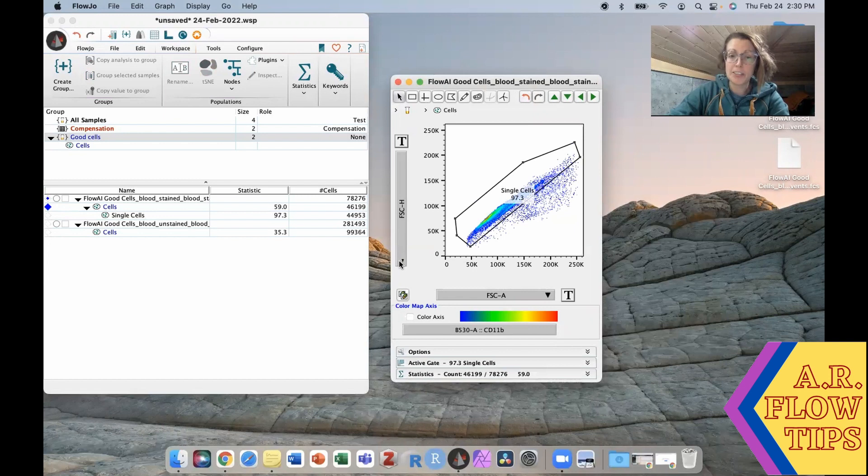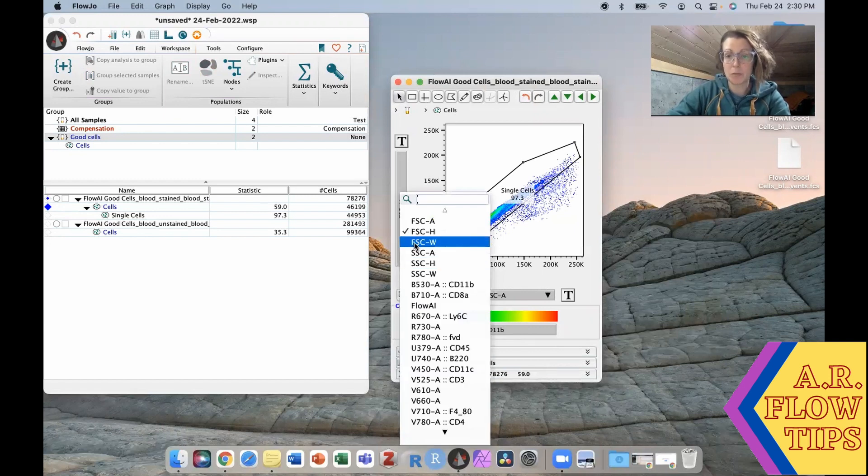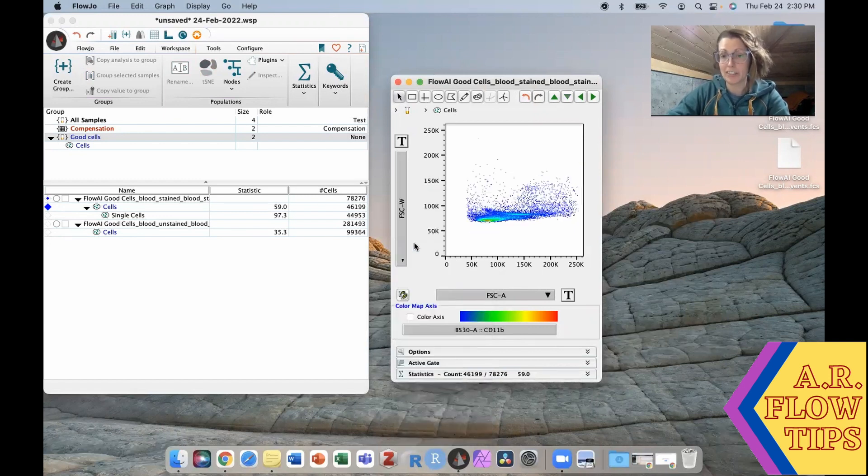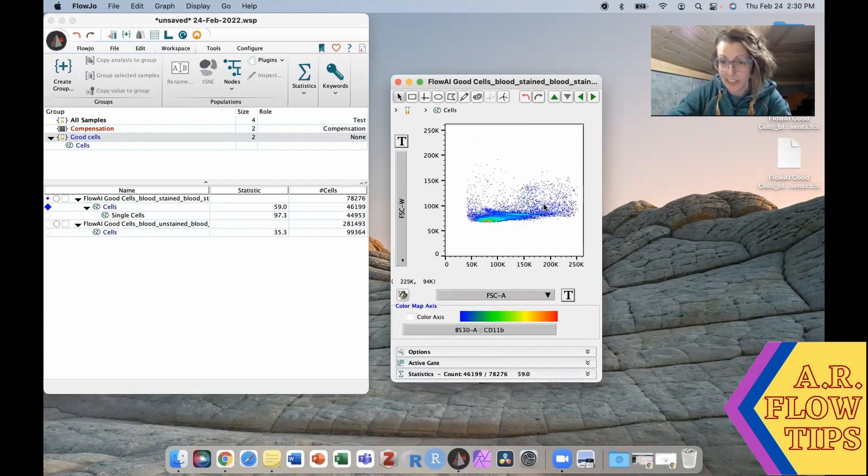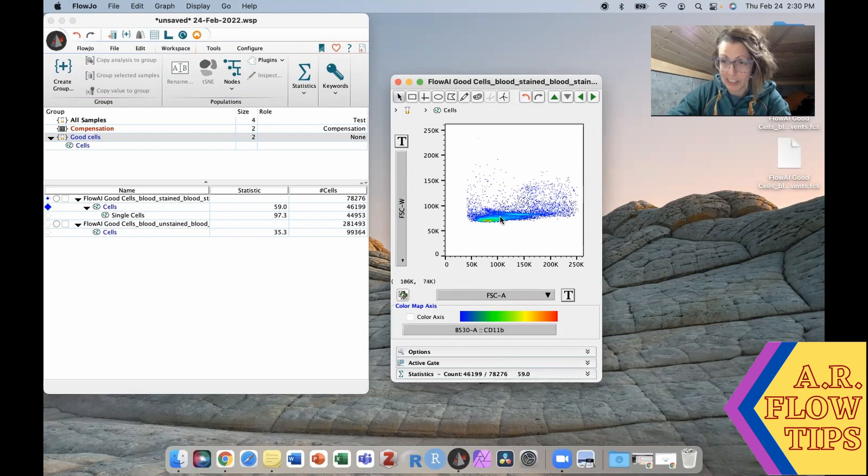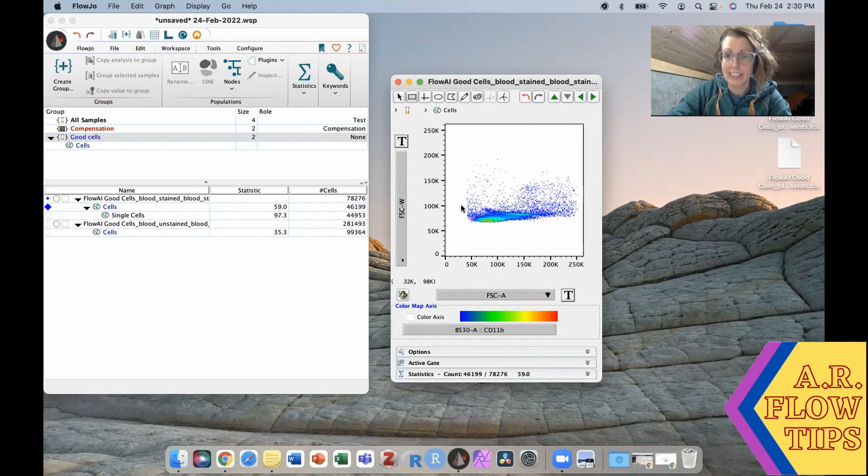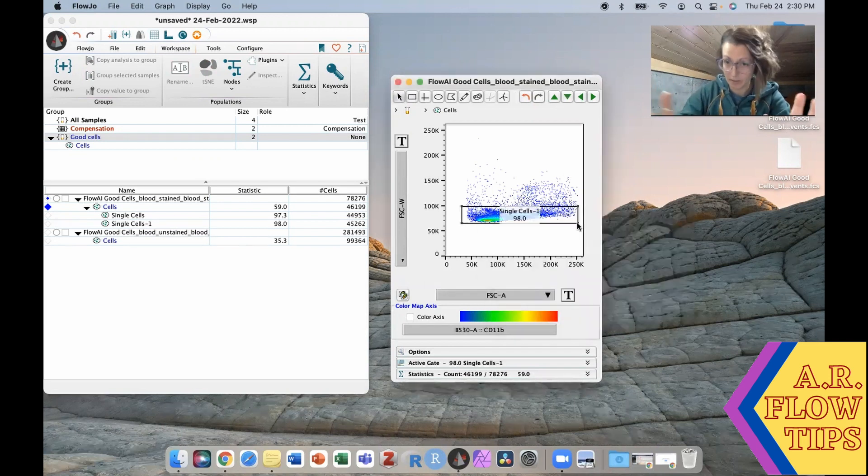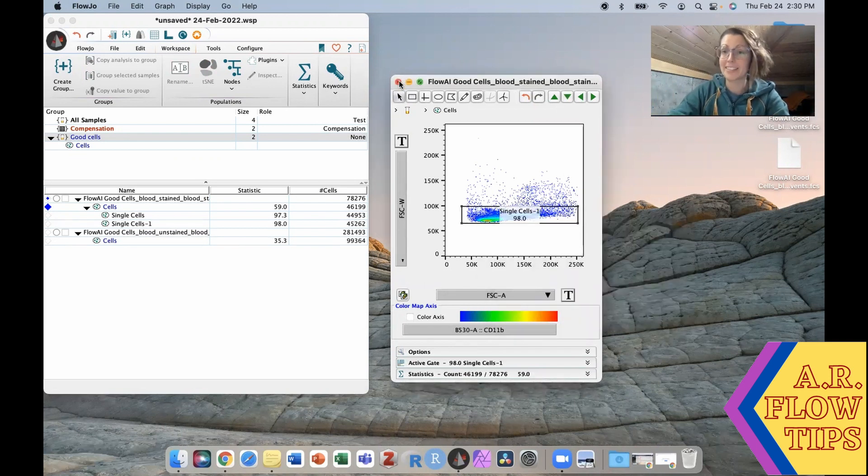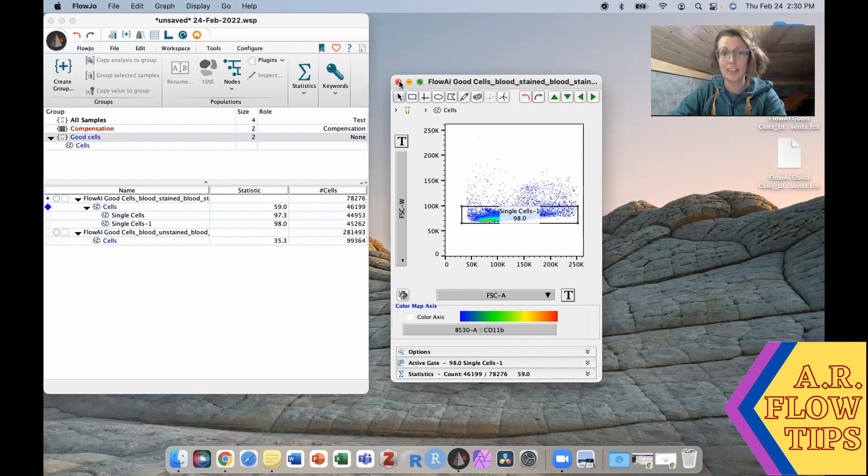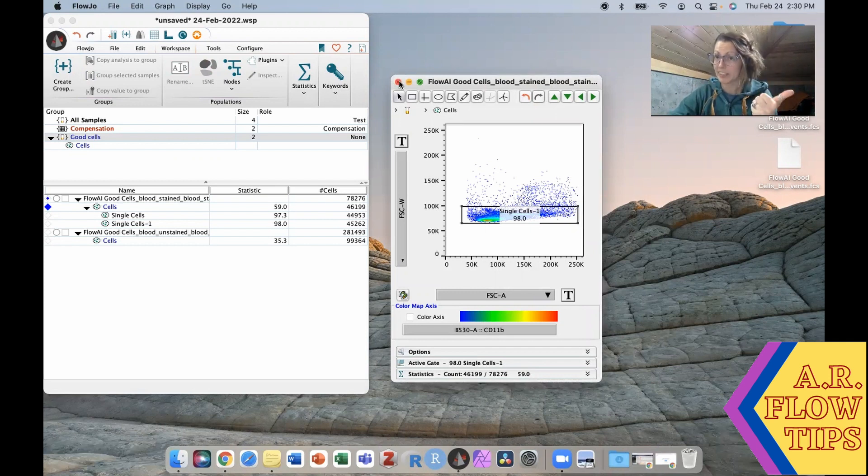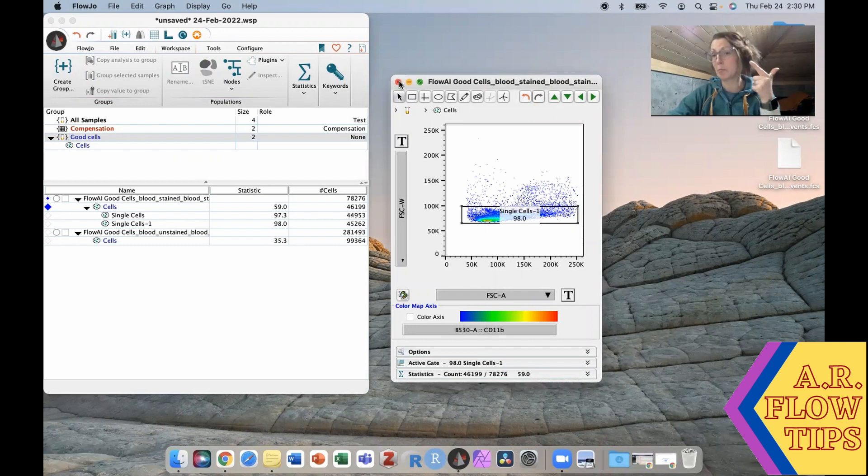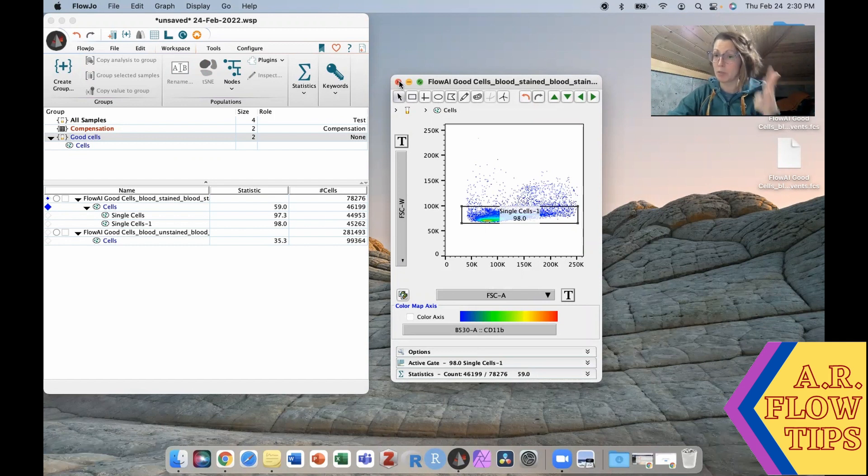You may also see people using forward scatter area versus forward scatter width. In this case the single cells are this population here, doublets are the one above, so you would gate it in that manner. So again whichever one you choose to use. So that's data cleanup number three. Removed bad events with a plugin or a time gate, we removed our debris and our clumps, we removed our doublets.